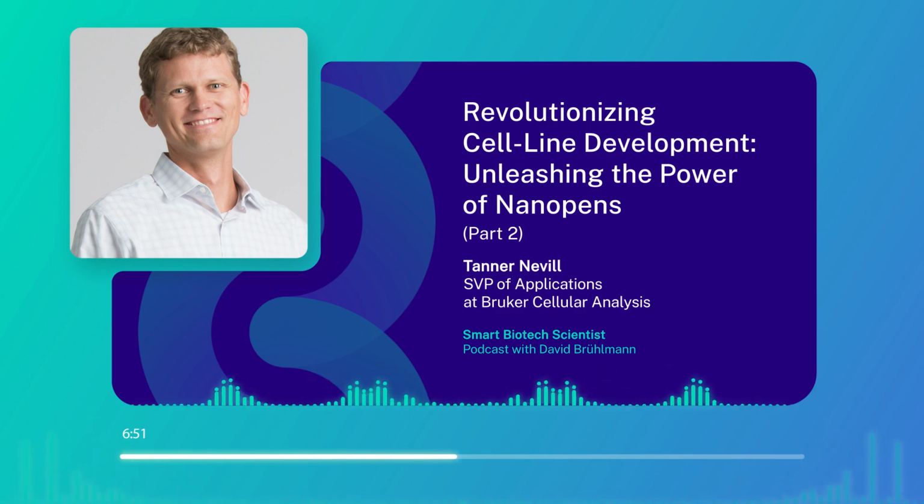I will admit, I'm probably not the expert. My focus has really been on the front end of the screening, so that scale-up process is not something that I can speak too intelligently on. But I do think tech transfer is a very difficult thing and oftentimes underestimated. It depends a lot. If it's a handoff of a process from one facility to the next, meaning we've developed this end-to-end process at this site and we just need to copy and paste it over here and they're going to do the same thing, that's one thing. But if you're actually handing off from one group to the next, that's tricky.